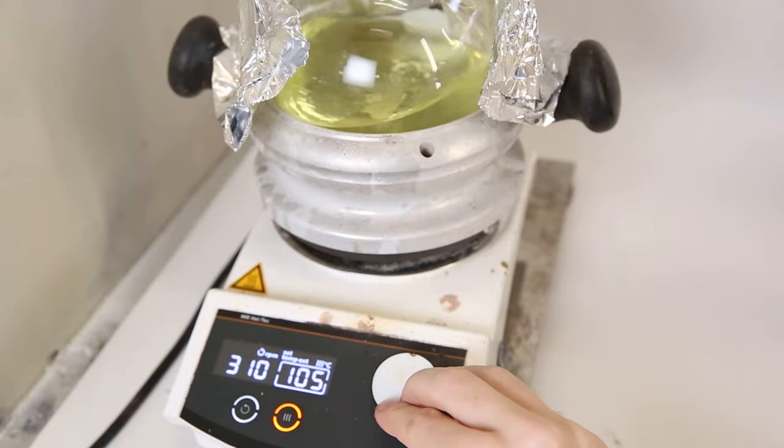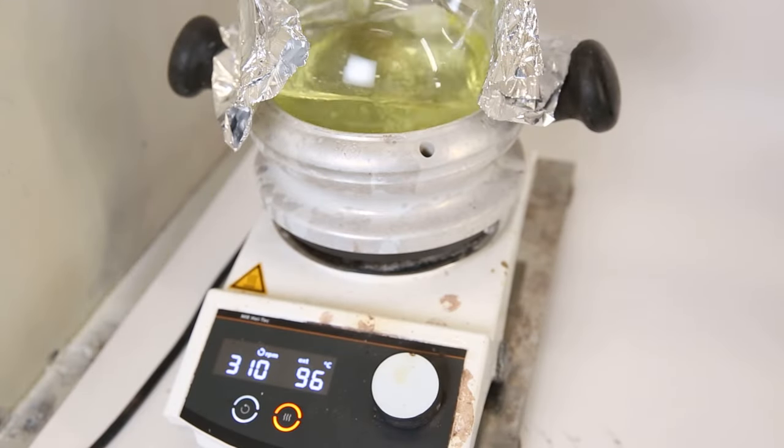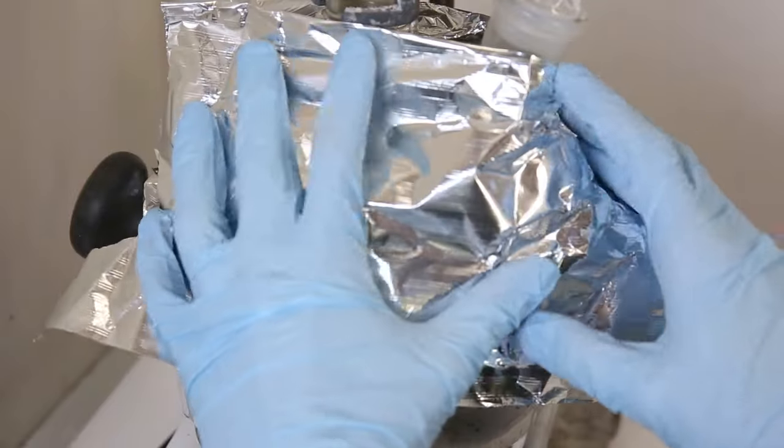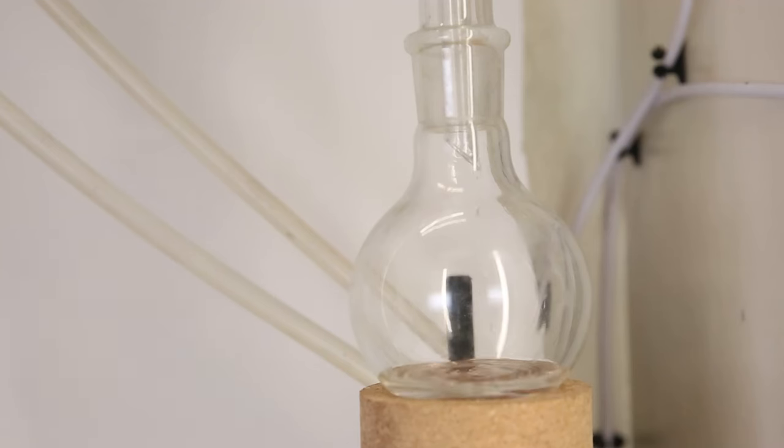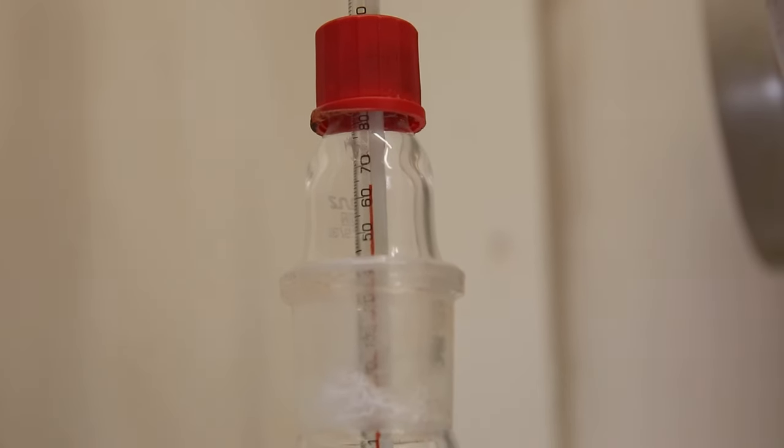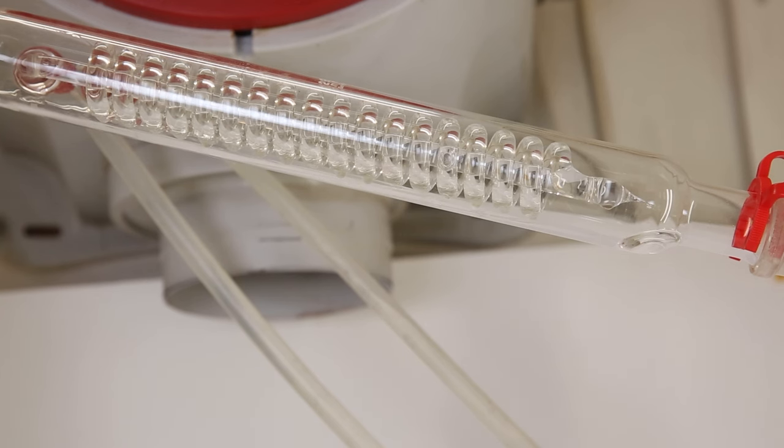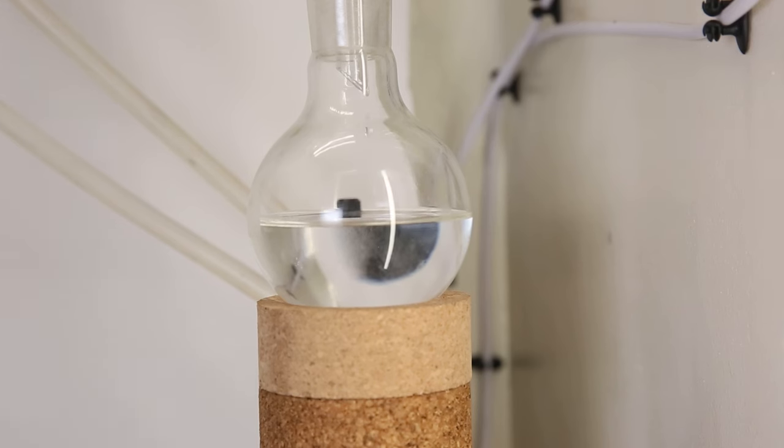I slowly increased the temperature to get the next fraction to come over. Another liquid started coming over quickly, and the thermometer stabilized around 65°C. Most likely, this is isohexane, with a boiling point of 60°C, and hexane, with a boiling point of 69°C.